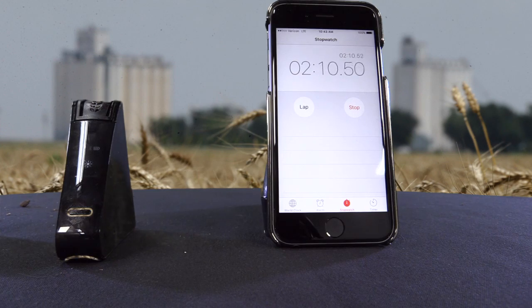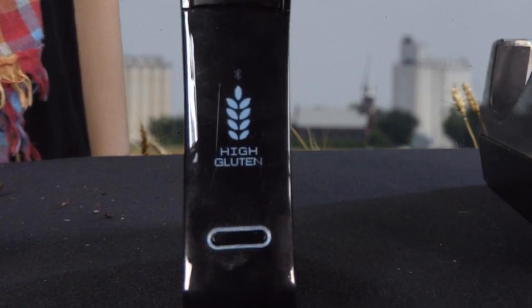The second item we are going to test today is a package of Oreos, which we do know has wheat in it. So we are going to do the same thing that we did before — we have another capsule here. As we expected, the Oreos came back with a result of high gluten found.